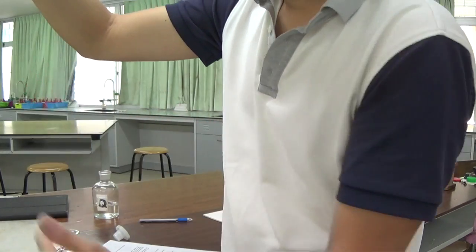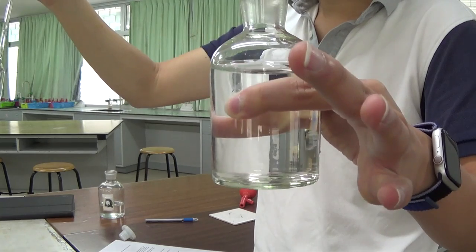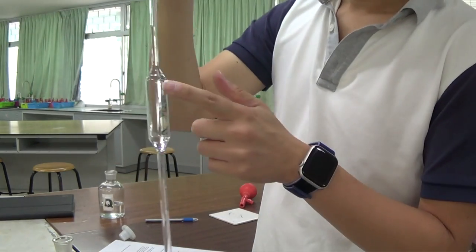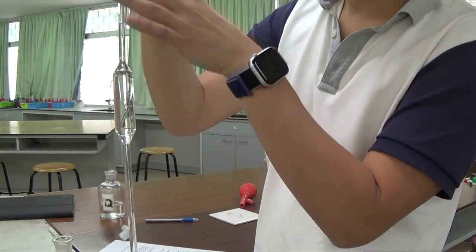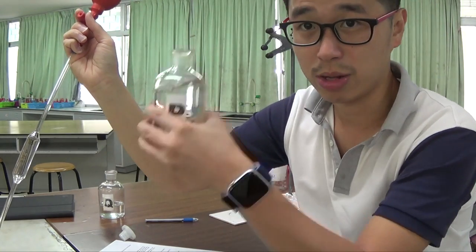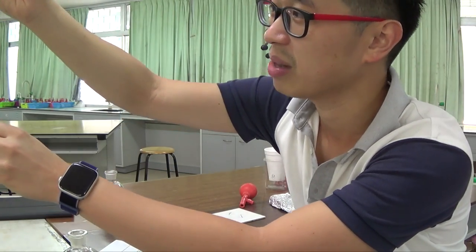One thing I can stress is that once you suck out into the pipette, do not put it back into the bottle again, because you never know if there's water in here, and you're affecting the concentration. Once you suck out, you do not ever put back into the bottle, okay? This is a big danger. Whatever you suck out from the bottle already, do not ever put it back into the bottle, okay?